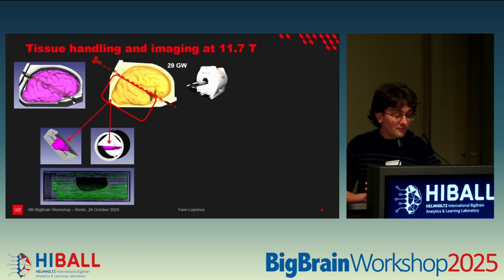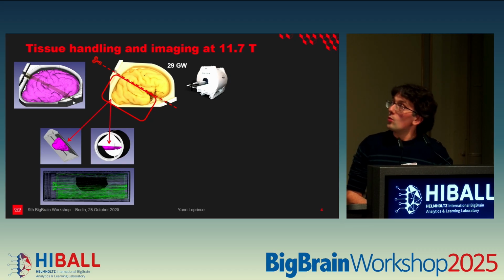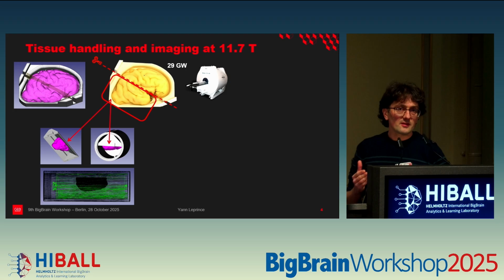So, how did we overcome this limitation? Well, we are using a blockwise imaging technique. First, we image the whole brains or whole hemispheres, and we plan a cutting plane digitally. We then realize 3D printed cutting guides that we use to physically section the brain into separate blocks.